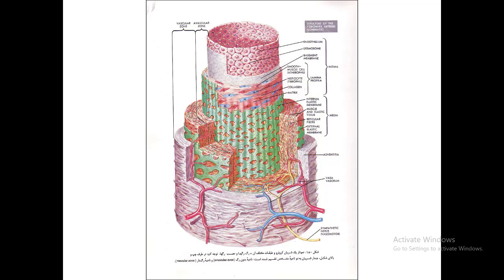Hello students. Our topic today is the circulatory system. Here you observe one structural model of the wall of vessels. I told you that we have one structural model that represents all vessels, simplified in the small vessels such as capillaries. The innermost layer, that is also the thinnest one, we call tunica intima, that is composed of one endothelium, that is simple squamous layer supported by lamina propria or loose connective tissue.